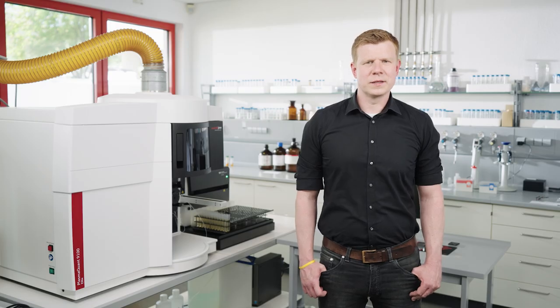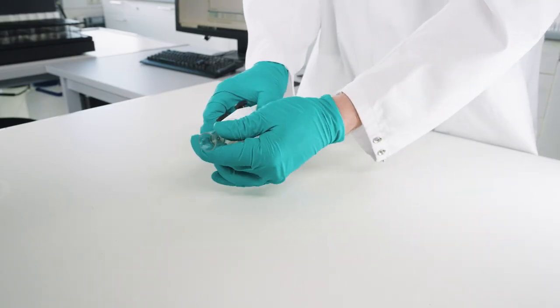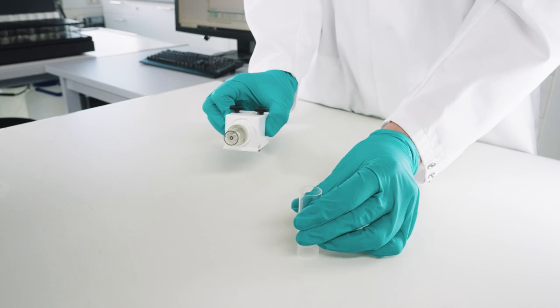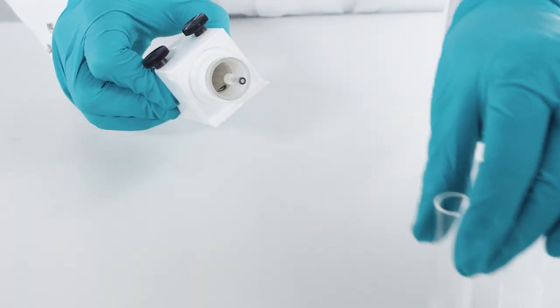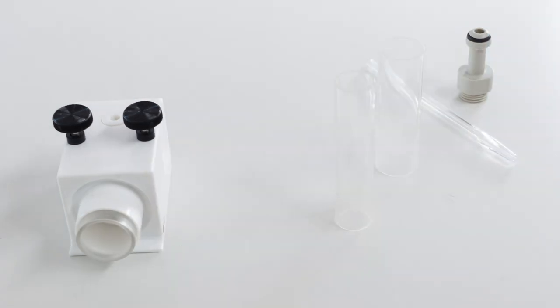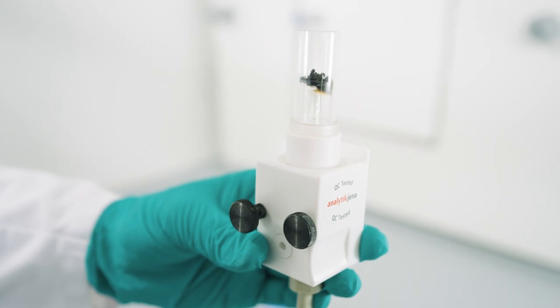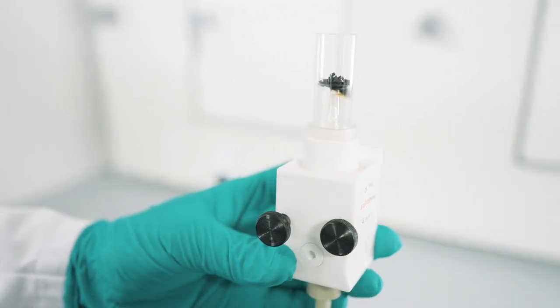Using the correct method settings can almost eliminate these carbon depositions, and therefore cleaning is not required very often. Cleaning is most efficient when the torch is disassembled into its individual parts, and this is of particular importance for the cleaning of the injector. Unsuitable method settings result in an injector that looks like this, which needs to be cleaned very frequently.